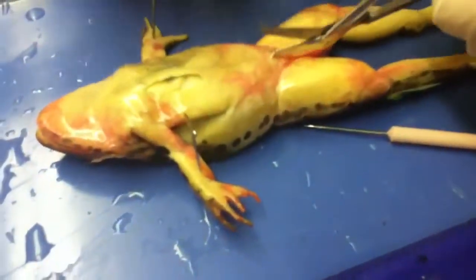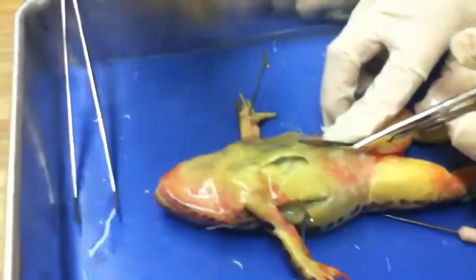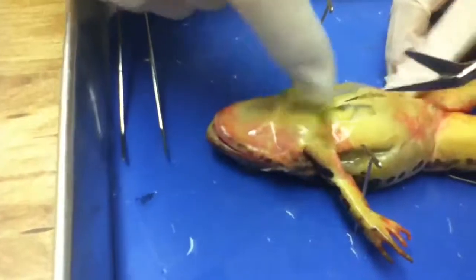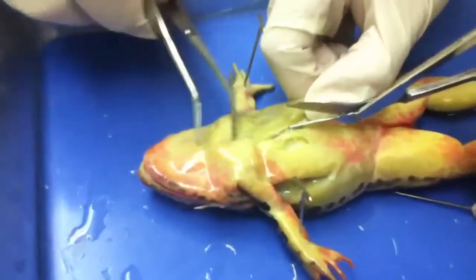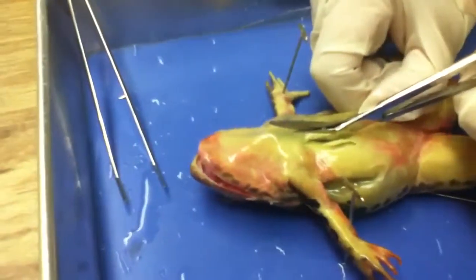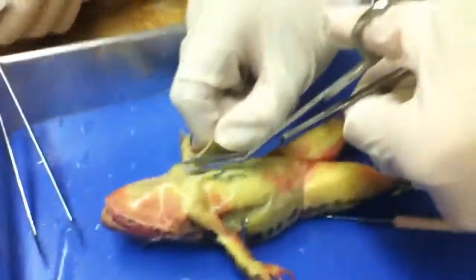Okay, now you can just run that straight up, and you want to cut all the way up. Pull up a little bit, so you're not going to cut into the abdominal wall. Keep cutting up here. Higher. We got nothing now.